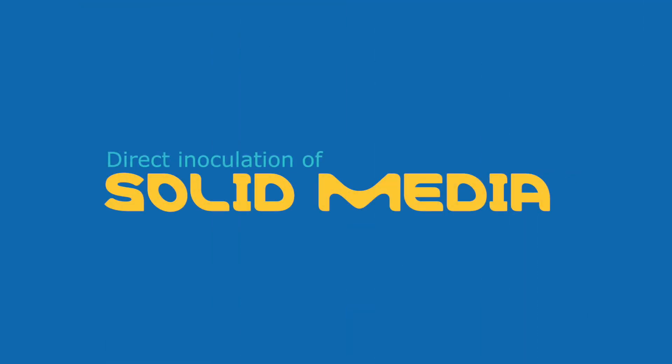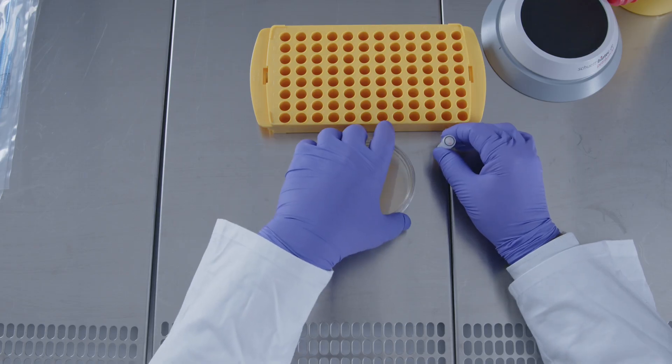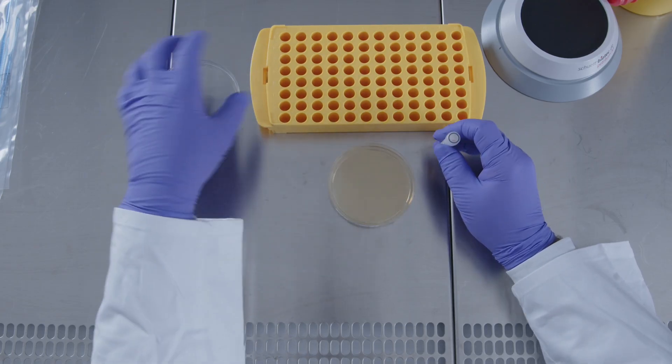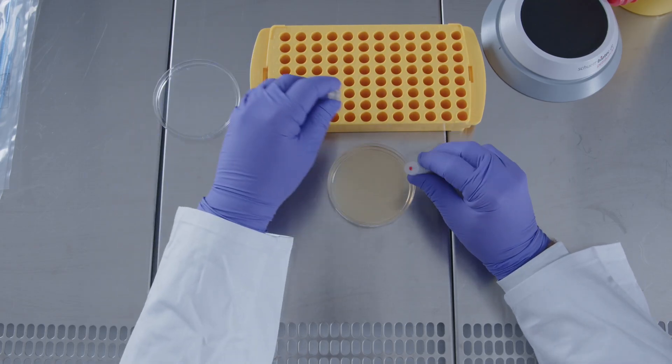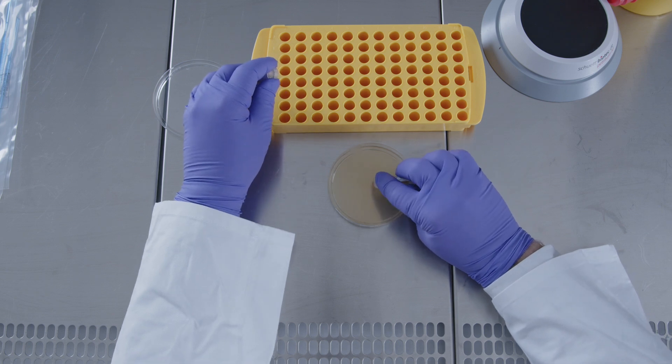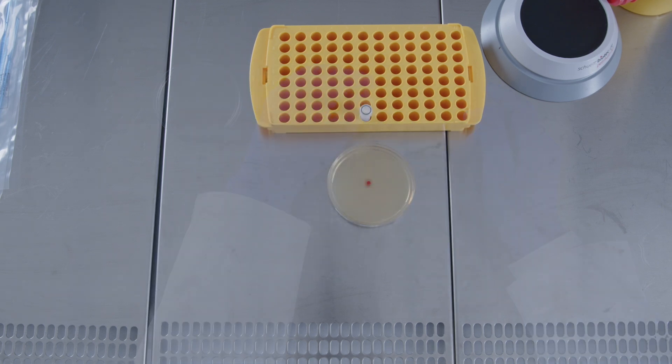The discs can be used to directly inoculate solid media. Open the vial and drop the disc onto the agar plate. Close the plate and leave at room temperature for the disc to rehydrate.